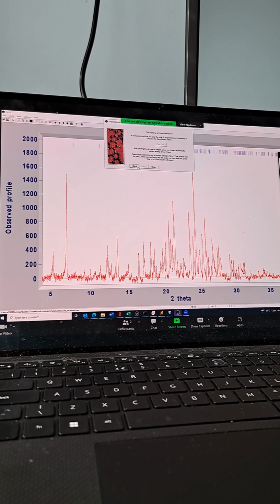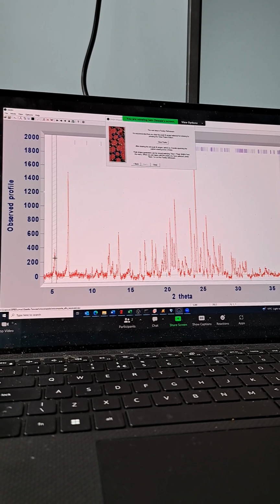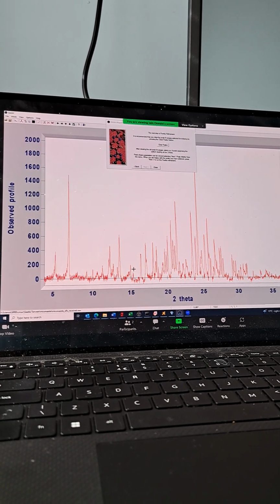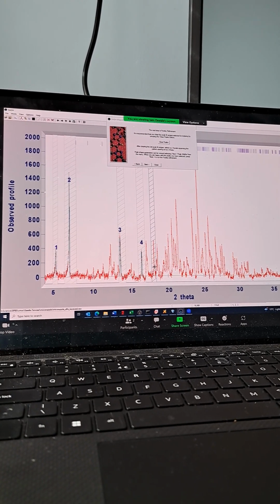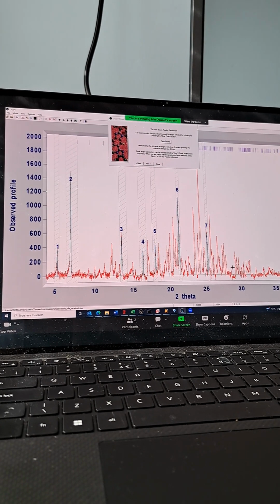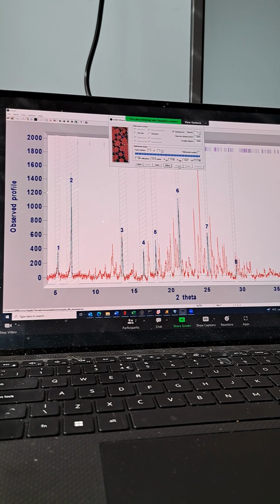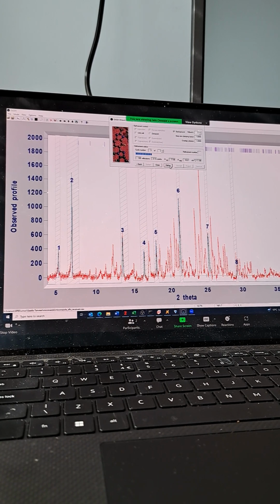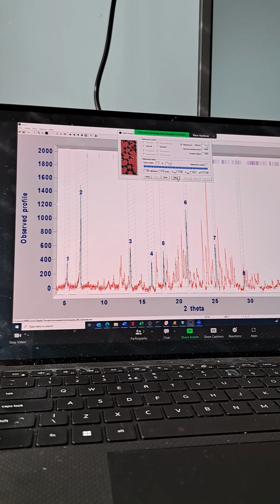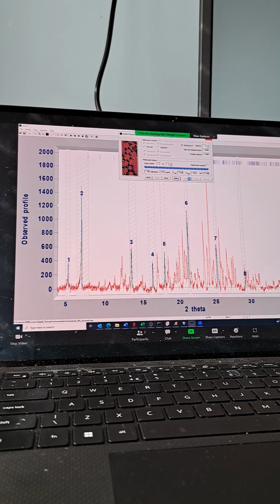Okay, and then, for example, we're using our mouse, dragging over. So this is in the tutorial. You'll drag over using your right-hand mouse button, and you just want to pick peaks right across the diffraction pattern to be able to do this. And click on next, and we come to some sort of a refinement. It's going to be nonsense because it's not the right unit cell, it's just going to be rubbish. But I'm just wanting to get to the next screen.